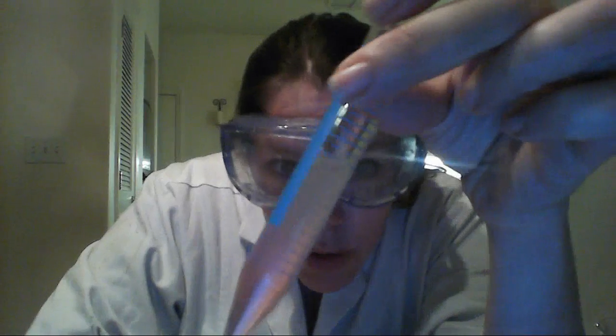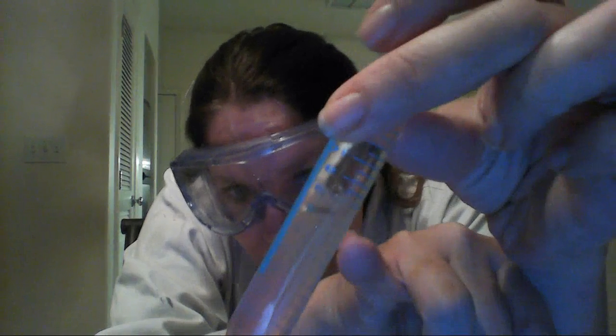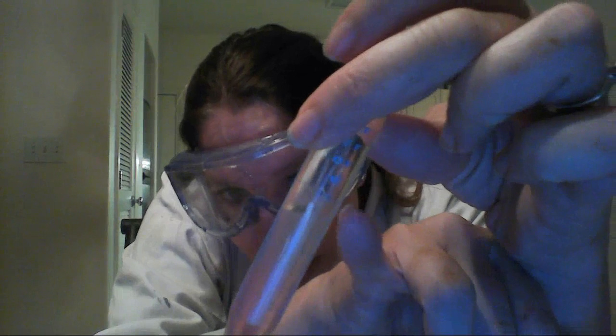Okay, so again, I can already see my DNA, and I don't know if it's going to show up in the camera. You can kind of see right there. You'll see some stringy stuff. You guys see that? See my DNA there? It's so cool. You see that floaty, webby, white stuff there?